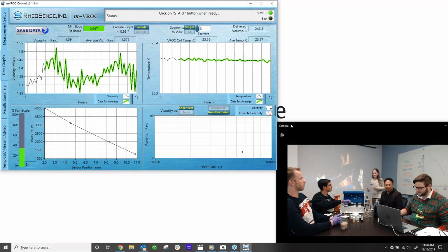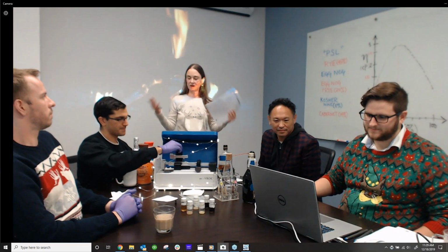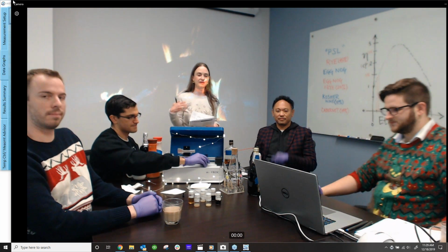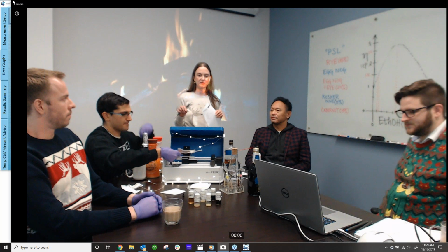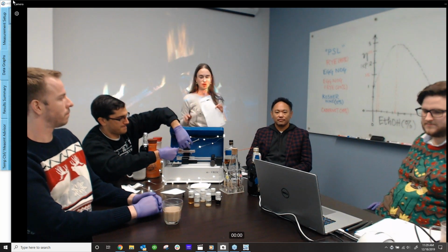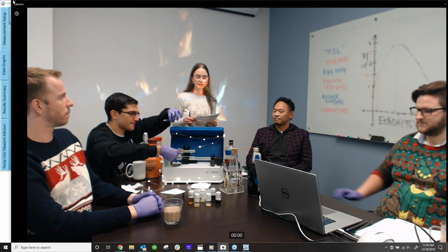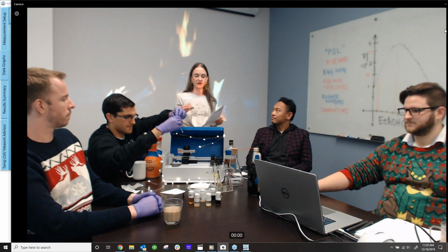Okay, thanks for all the testing. So once you've collected your data, it's always a good idea to take a look at it and think about it and say, does this make sense? Because we always like to point out to people that viscosity is not a directly measured property, it's calculated. So things can go astray no matter what type of instrumentation you're using. And we always like to look at the data and see what we can extract from it and whether it makes sense.